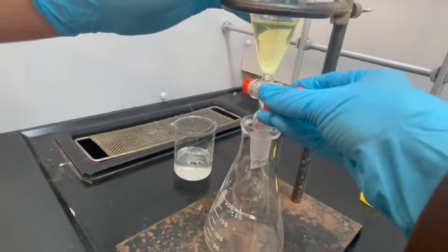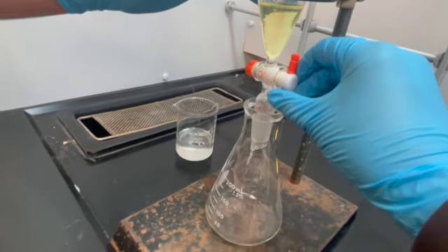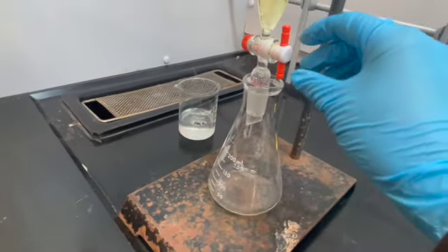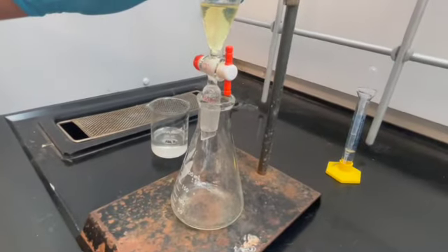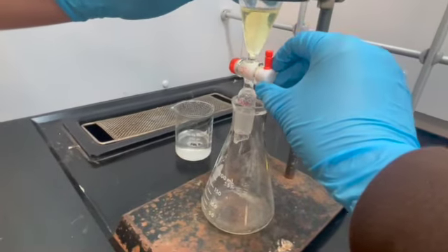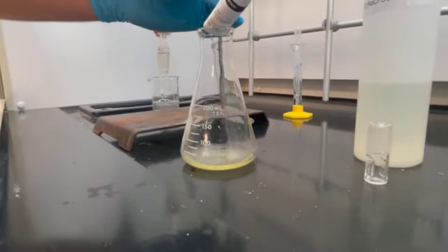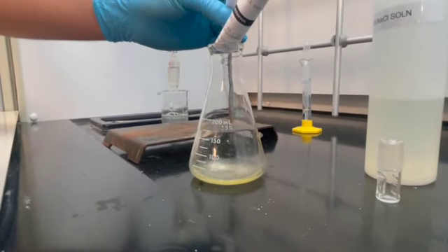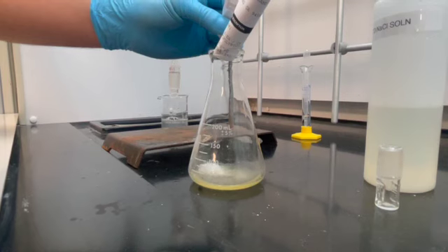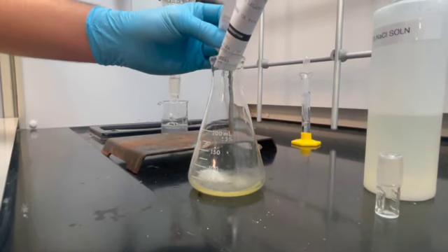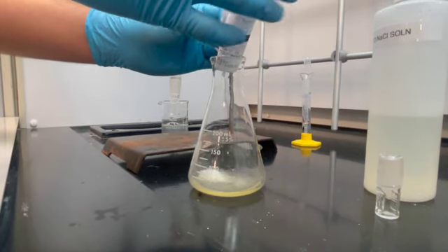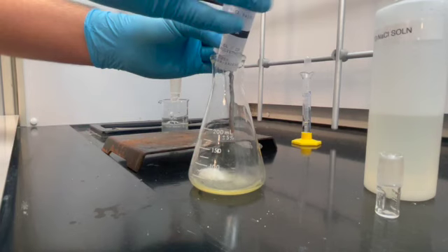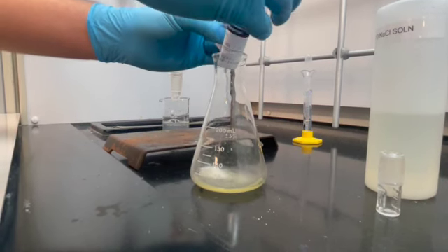We are taking our organic layer and putting it into an Erlenmeyer flask. Now we are adding the solid magnesium sulfate to our organic layer, then we are going to stir it with a stirring rod. We used around 3.002 grams of the magnesium sulfate.